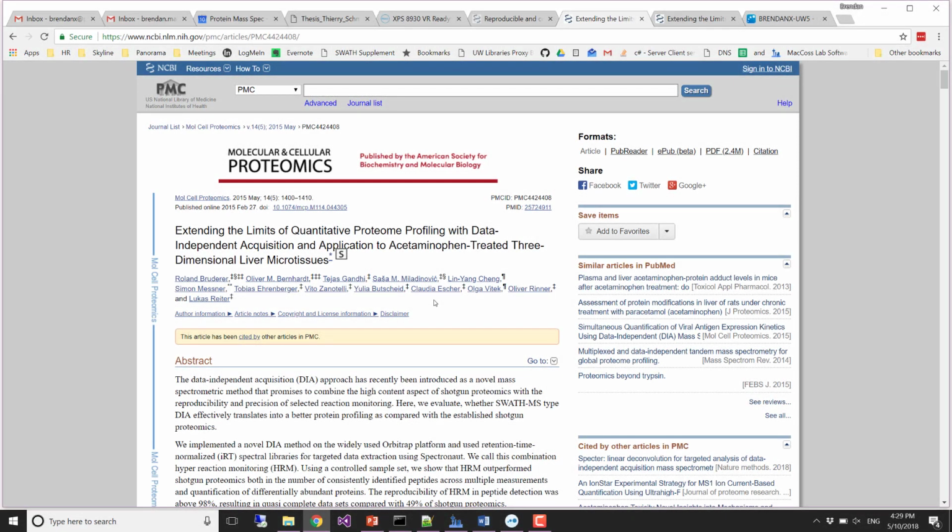Okay, so for the last little bit, we're going to turn our attention to a real-world data set where the people doing the measurements actually did this workflow of trying to find a full discovery data set inside of DIA data. So no longer targeted to a specific pathway or complex or some small cellular function, but to actually target as much as a DDA run would target.